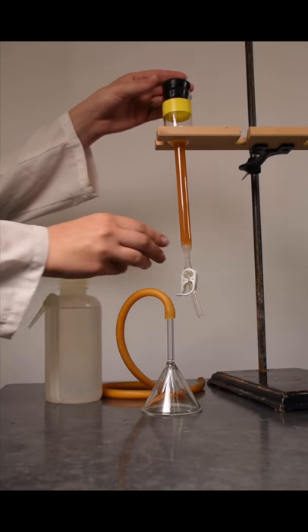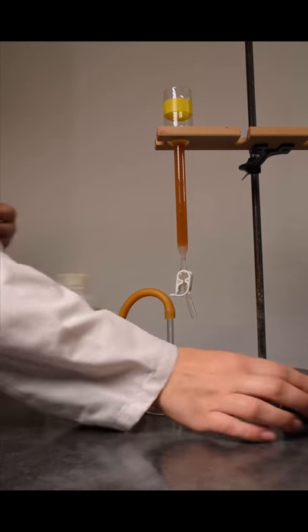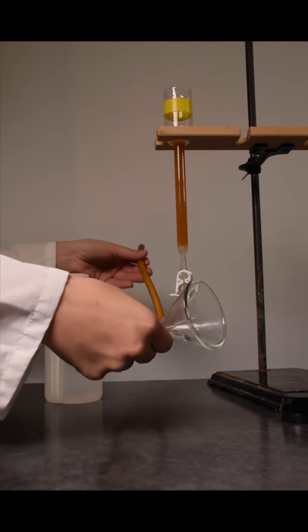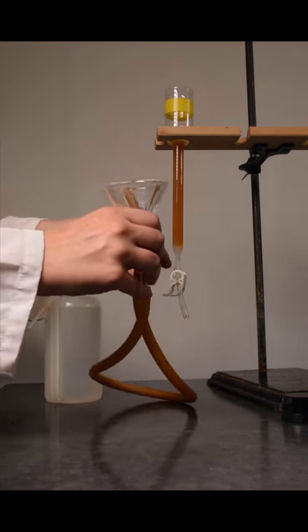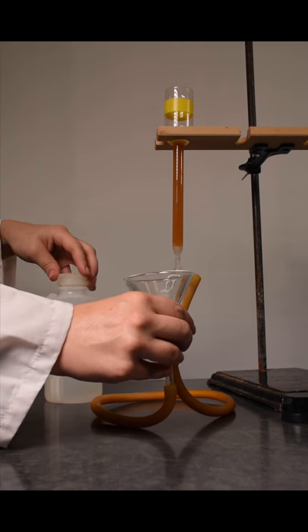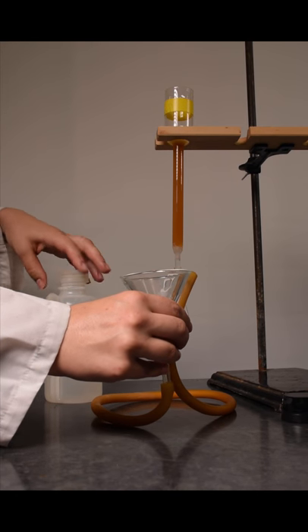Use the funnel support to hold the column. Prepare the ion exchange column by removing the stopper. If the solution level is near the top of the column, carefully pour a small amount off the top, or allow it to drain through to accommodate for the backwashing.